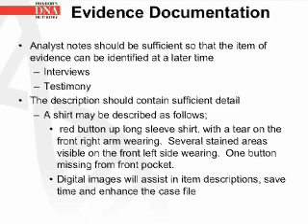Analyst notes should be sufficient so that the item of evidence can be identified at a later time, in interviews or testimony. The description should contain sufficient detail. A shirt may be described as follows: red button-up long-sleeve shirt, with a tear on the front right arm wearing, several stained areas visible on the front left side wearing, and one button missing from the front pocket. Digital images will assist in item descriptions. They also save time and enhance the case file.